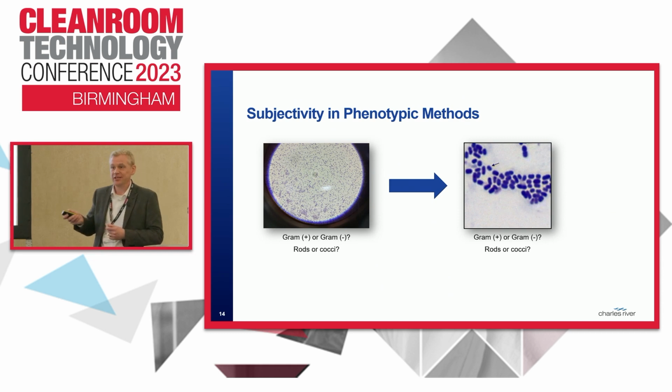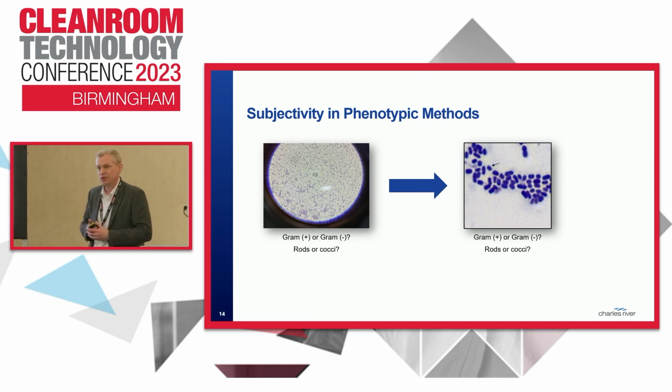But what's even more striking is the color. The gram reaction is the color. This looks like a gram-positive reaction to me. It should be pink if it's gram-negative, but this is a gram-negative bacteria. Okay? Now, the reason for that in this case is Acinetobacter are actually notoriously difficult to destain, meaning they retain the stain that should stay in the gram-positive, and they don't turn pink with all the subsequent steps. So they look like gram-positives.